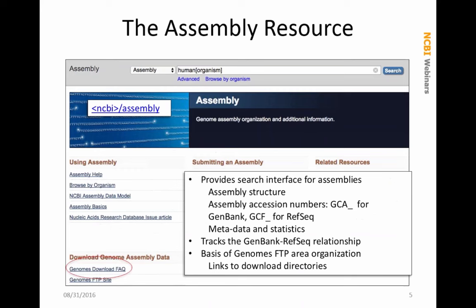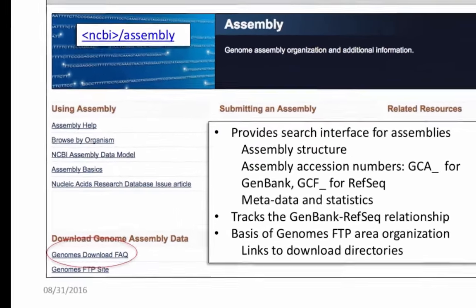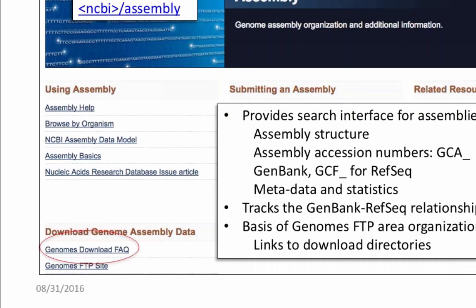The Assembly resource is one of our Entrez databases. It is the main way of finding out what genome sequences are available for particular organisms, and even metagenomes are in here now. We now have accession numbers for assemblies: GCA for GenBank assemblies and GCF for our RefSeq assemblies. This is how you track the relationship between GenBank and RefSeq, and it is the basis for the organization of the FTP site. Notice the link to the Genome Downloads FAQ — a lot of what I will be telling you today is based on that FAQ, and it is worth a read.